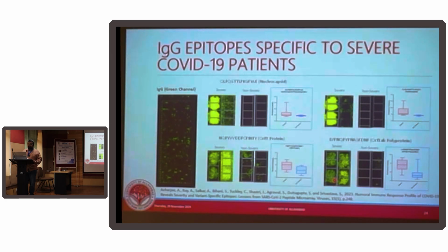Microarray is also costly. Slides cost 50,000, and the scanner that we used was around 2.5 crores. So yeah, omics is actually costly, mostly because there is very little adoption of the technology. The more you go back to your labs, convince your supervisor, and have more sales, the prices come down.